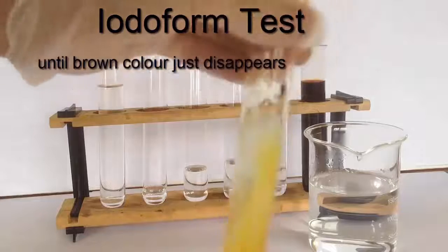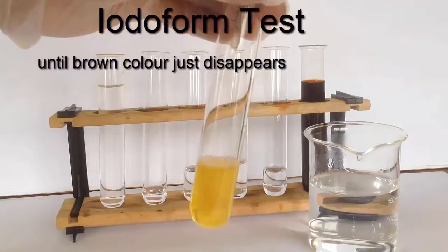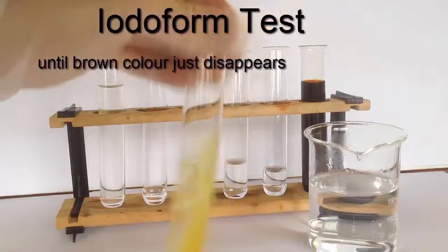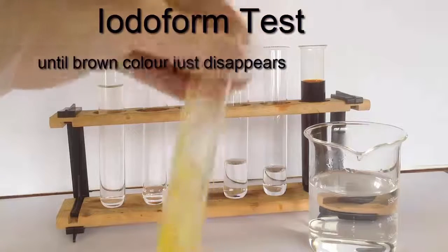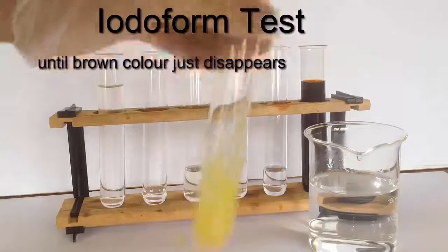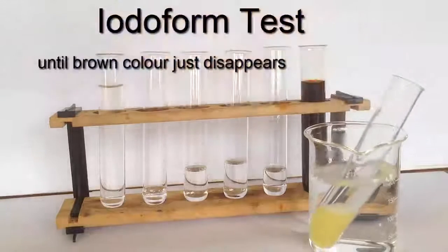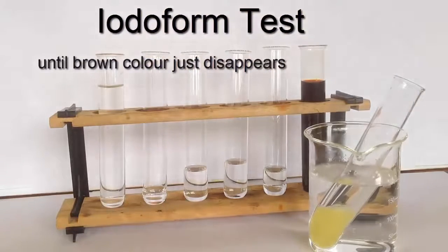So the brown color is fading as I continue to add the sodium hydroxide. So we're looking for one of two results. It is either going to go colorless and clear, or it's going to jump over to a yellow color and go cloudy as a fine yellow precipitate forms.